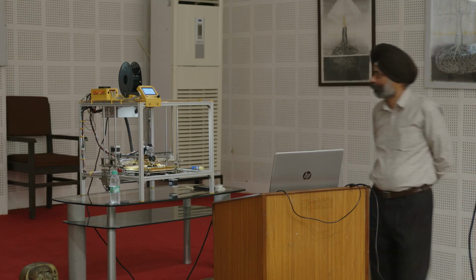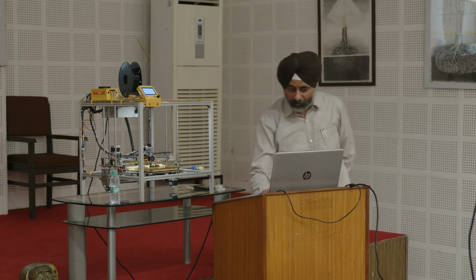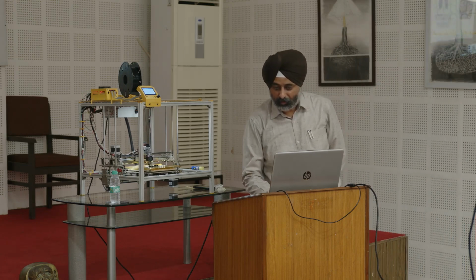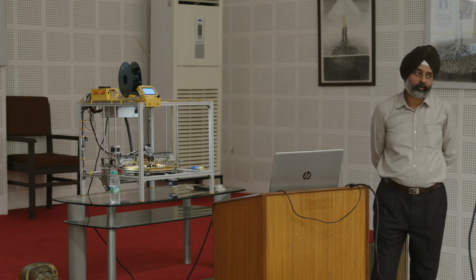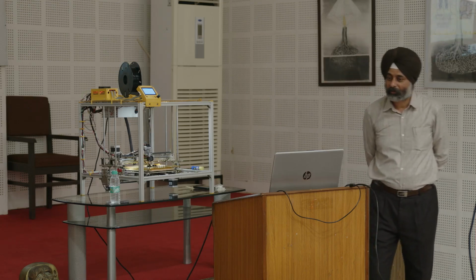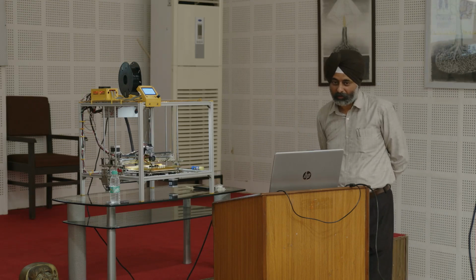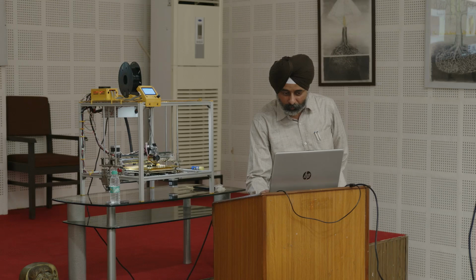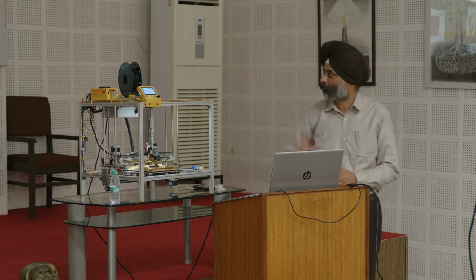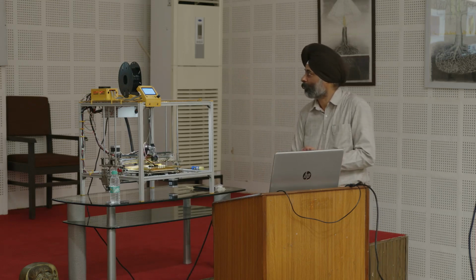So this is how it goes. Now the next thing that makes it all possible is access to open source hardware microcontrollers. The one you're seeing here is an Arduino microcontroller. Then we have free and open source software. These are some of the packages that we use for 3D printing.